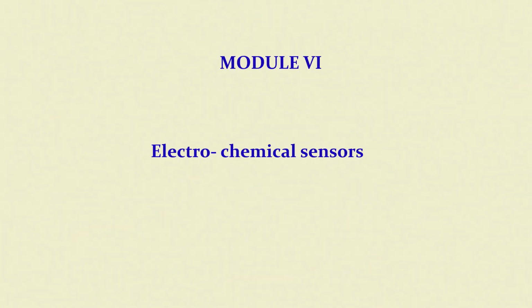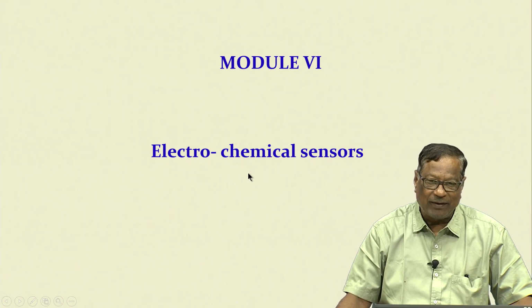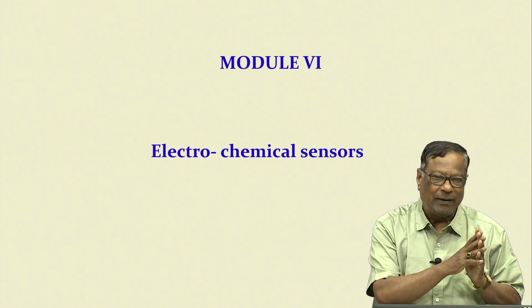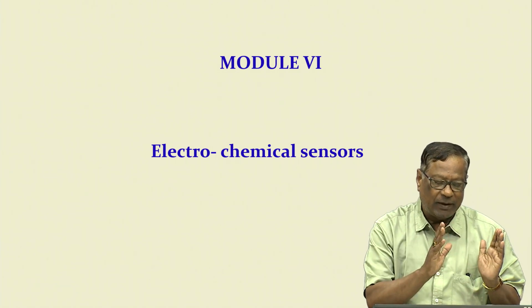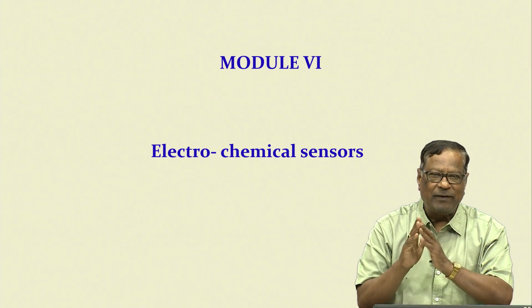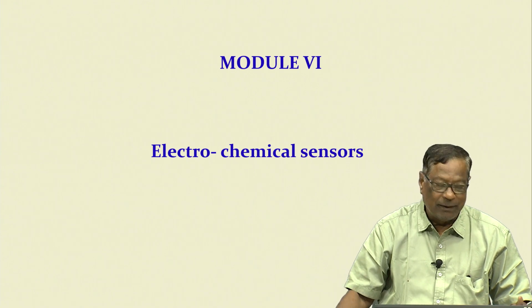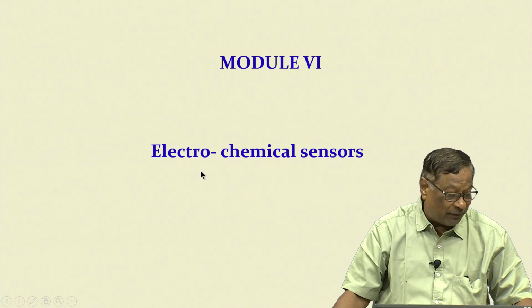So, here we complete our discussion on the ion selective electrodes, and we go into another concept of the electrochemical technology, that is electrochemical sensors. Slowly we are moving from basic electrochemical technology of measurement of voltage, current, etc., on to potentiometry, precipitation reactions, redox reactions, polarography, conductometry, and then Karl Fischer titrations, ion selective electrodes. Now we are moving into the world of sensors.